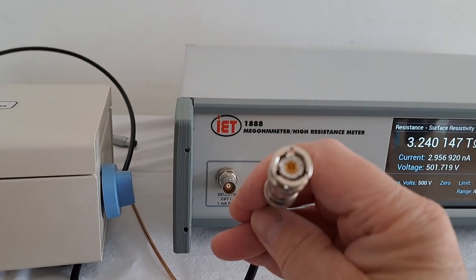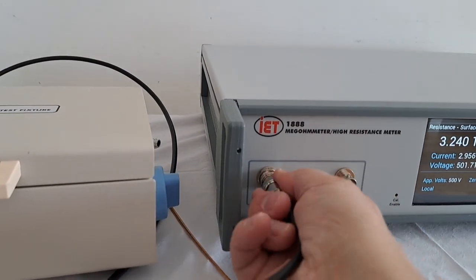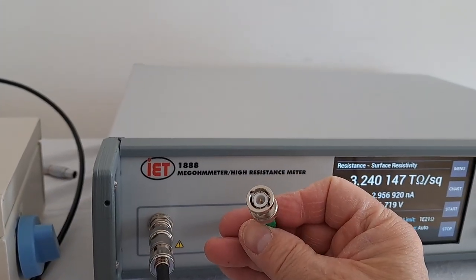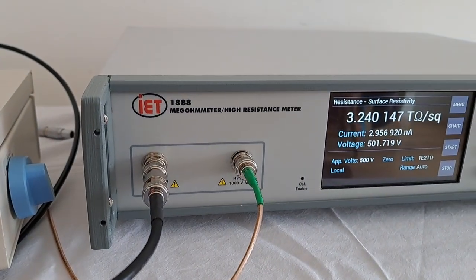The cell itself comes with connectors — one goes to a triaxial connector, just like that, which plugs into the detector. The other one is a BNC adapter that plugs directly into the high voltage output.